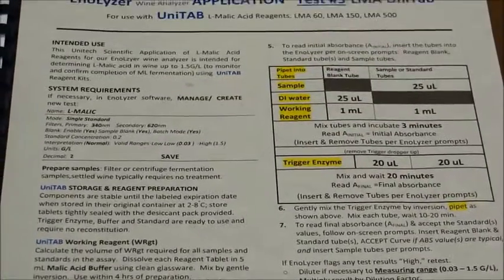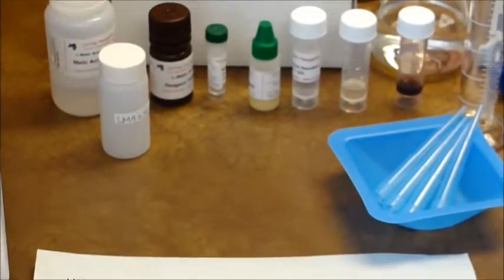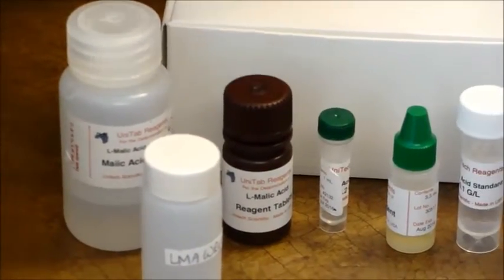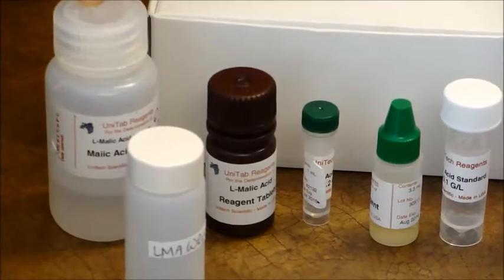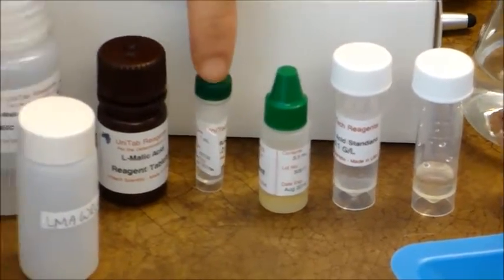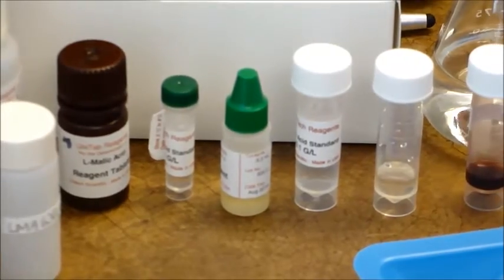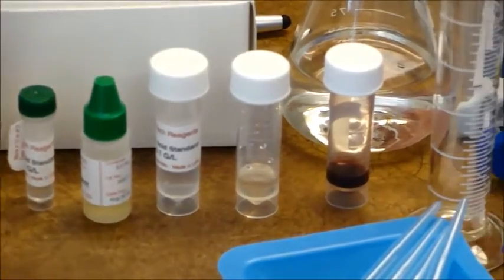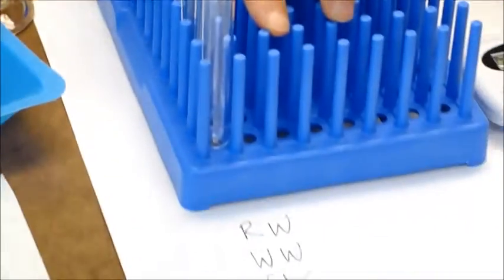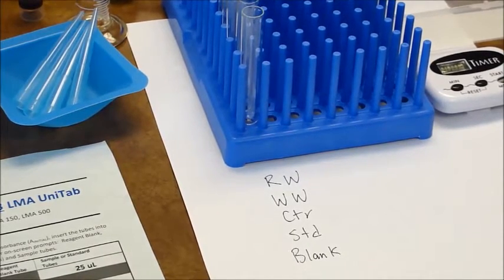The second step is to prepare the malic acid working reagent. The malic acid Unitab kit contains reagent tablets, malic acid buffer, the trigger enzyme (or start enzyme), and the 0.2 g/L standard. We're going to plan enough working reagent to test five tubes. We have a map of the tubes showing the location of the blank, the standard, our control (which will be the 0.1 g/L standard), the white wine, and the red wine.